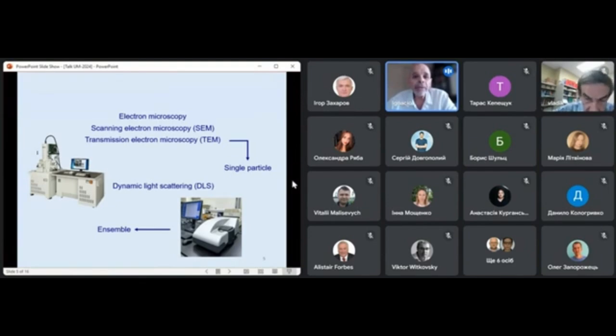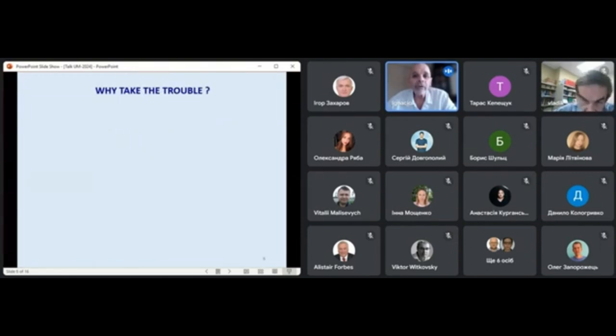So you might be wondering why a lab that focuses on one or both of these techniques would want to figure out their measuring uncertainties. Well, probably most of you know that this is important for a number of reasons. For example, in quality assurance, this is important for helping ensure that the data obtained are reliable and accurate, which is crucial in research and industrial applications.